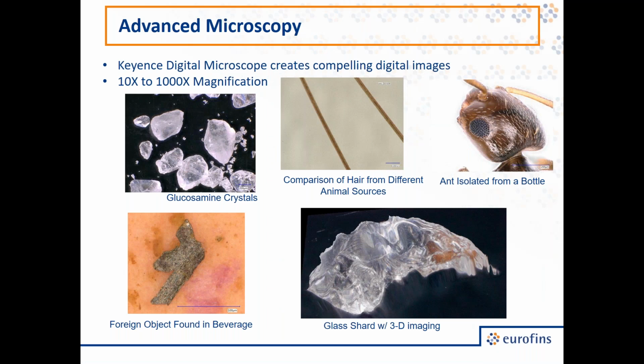One of the key things in identifying any kind of foreign material is to use multiple techniques rather than rely on just one. Any one technique is only going to give you part of the answer. So when we attack identification of foreign materials, we do it using a variety of techniques, customizing it to the specific problem that's facing us. One of the things we always start with, though, is good imaging. And these are some pictures that help us figure out what we're going to do next.